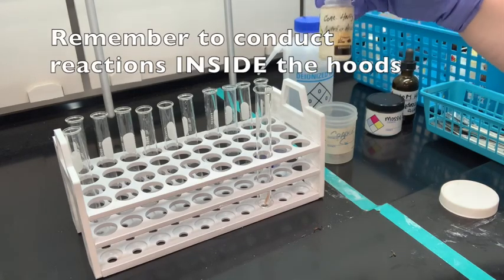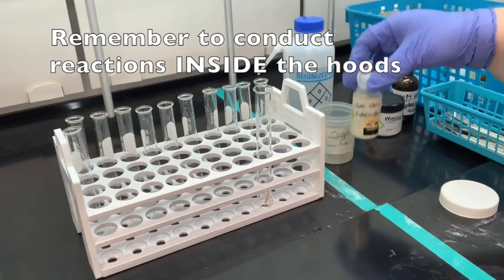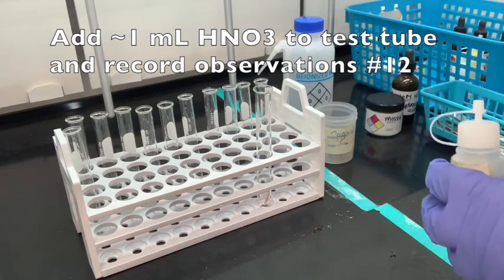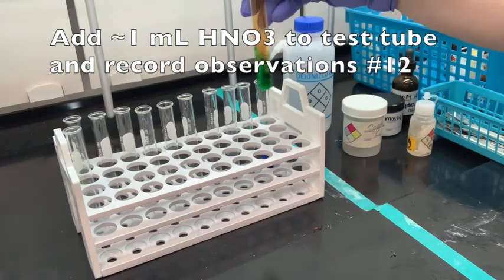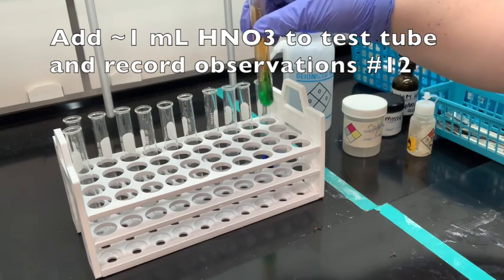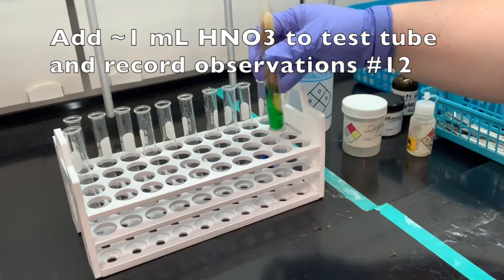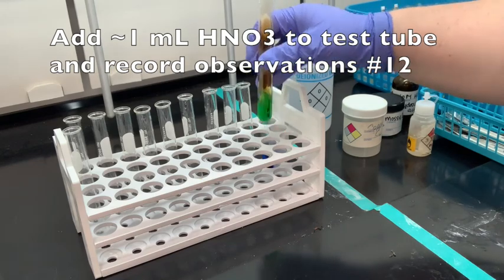Especially for this reaction, you do not want to breathe in any of these gases that might be made. You want to keep this inside the hood, but you can see that there's some liquid, a solution on the bottom, and there's also some gas coming out of that test tube. To hold this test tube, it is getting warm, so this reaction is releasing some heat. It also made that brown gas.